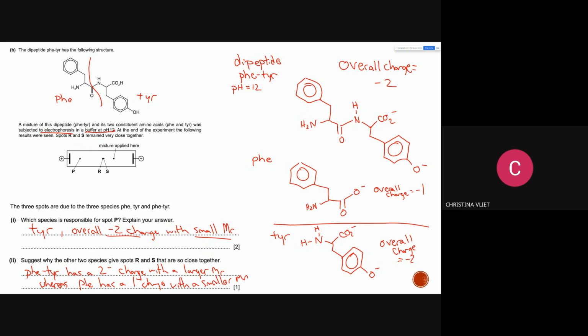Why does it not show all? Somebody's out right now. You're in line though. You can be after Samuel. Show the cathode, and this is the anode and this is the cathode.